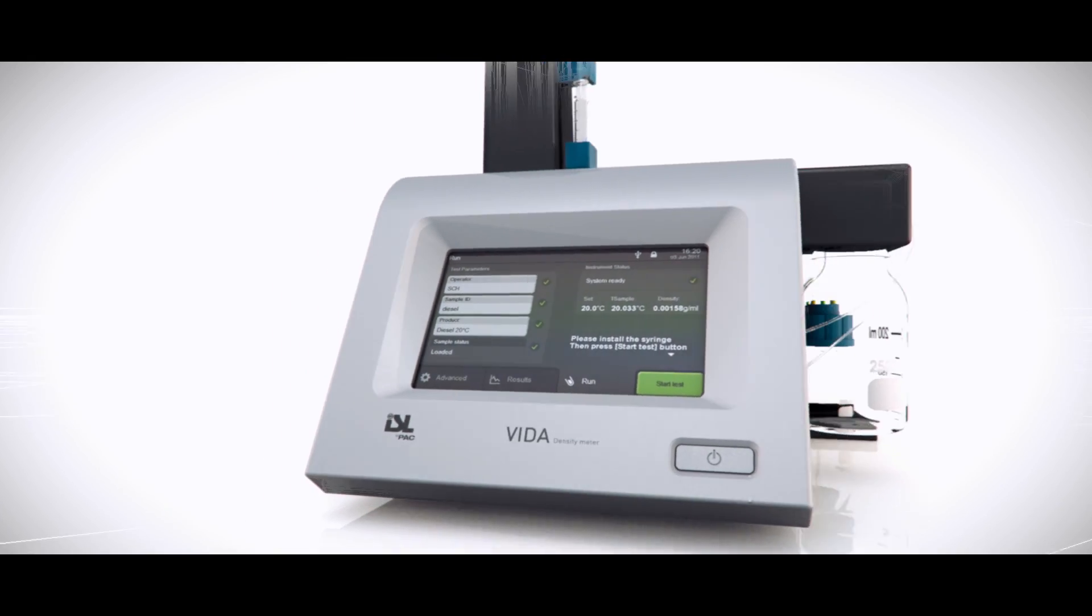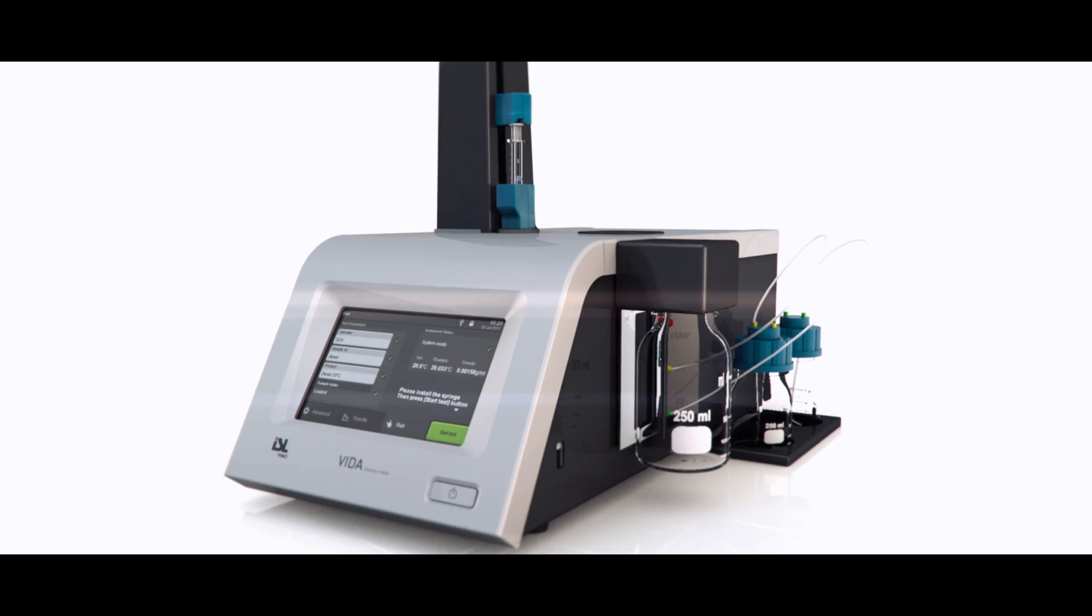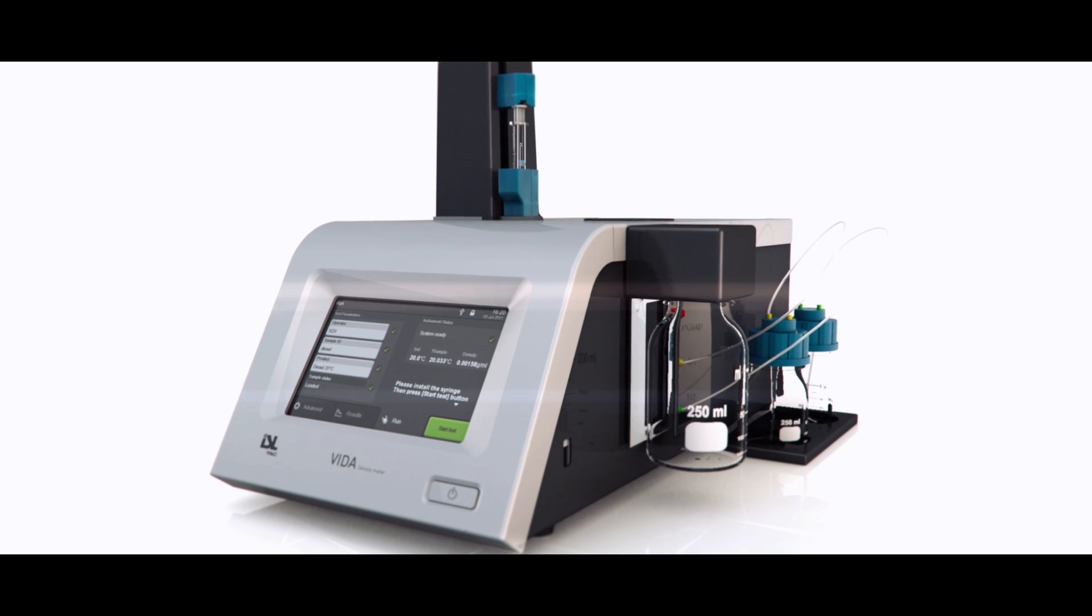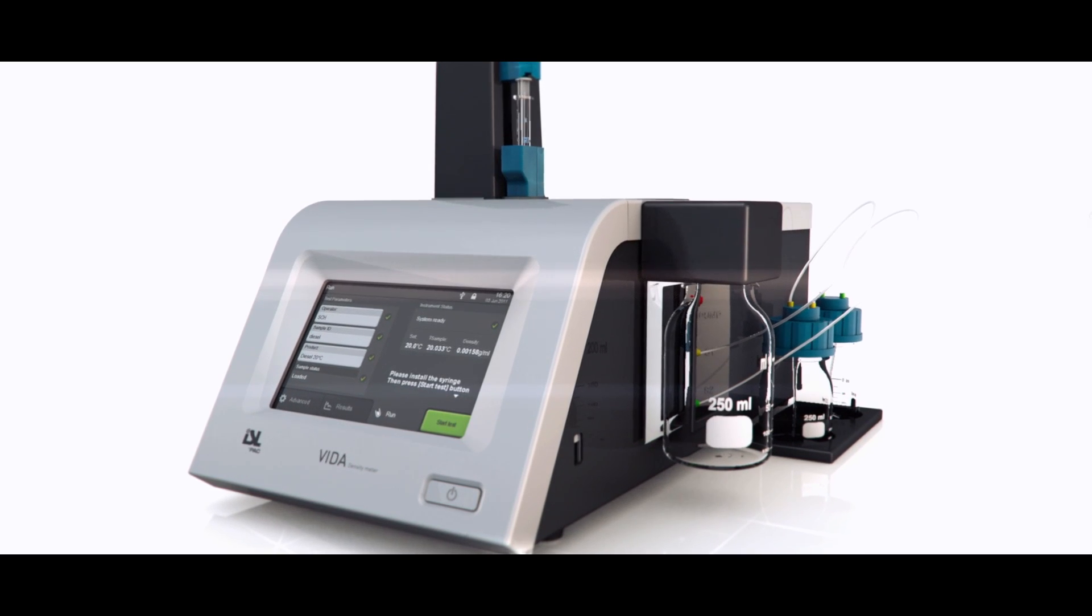We also used to struggle with tighter and tighter regulations from QSC standpoints. Even though at first the Vida looks like a black box, my team knows at any time what is the actual test status, while having access to all the critical information.